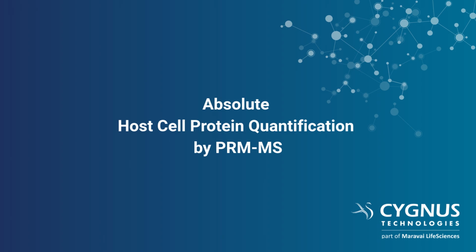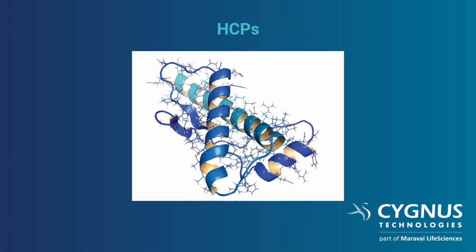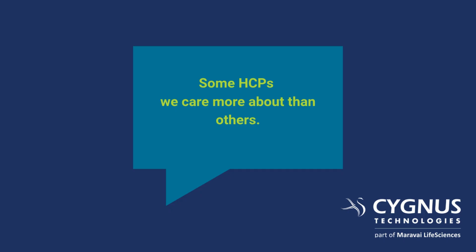This is the brief on absolute quantification of critical CHO host cell proteins. Okay, so let's talk host cell proteins, right? HCPs. They're leftovers from the CHO cells used in bioproduction.